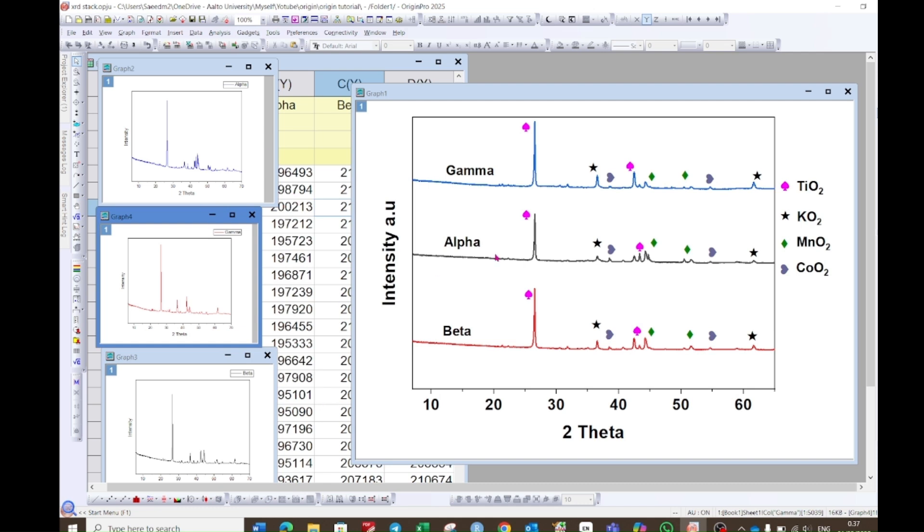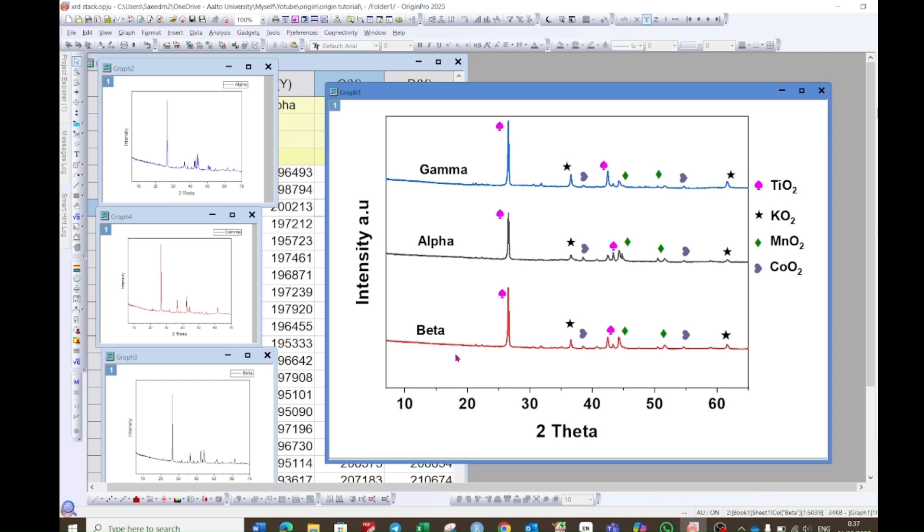Hello everyone, today we will see how we can stack different graphs to a single window. The graph will look like this at the end of the video. In this video there are three graphs that are stacked, but you can stack even more or less following the same procedure. So let's begin.